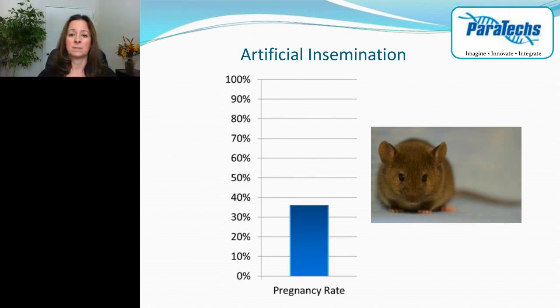Then move on to animals that are just pseudopregnant in a live format, and you'll find that it's an extremely easy procedure to perform. If anybody is interested in being trained personally in this method, we do perform workshops every year internationally and locally, and we can also do workshops on site if anybody's interested in that. It's a very easy procedure to learn.